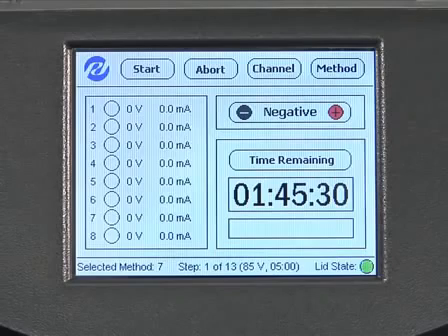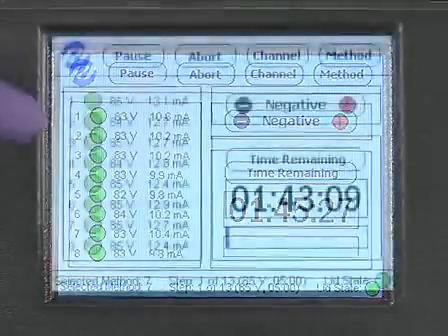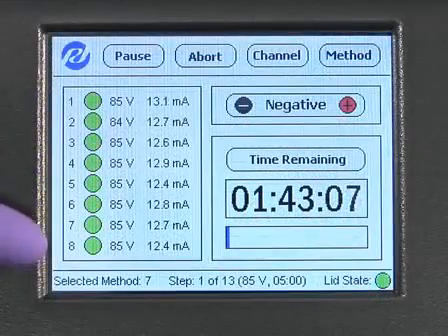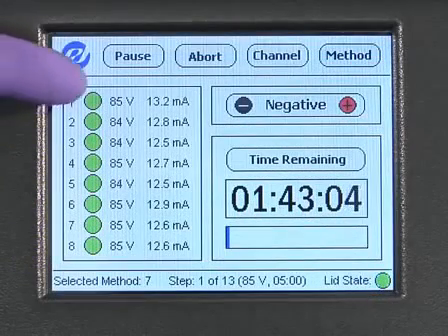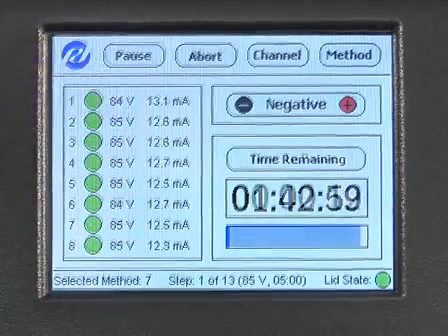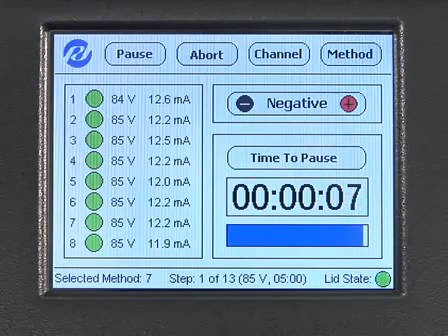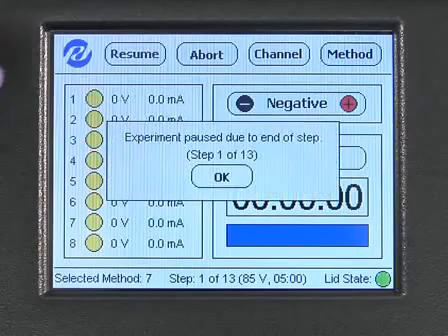Ensure that the safety lid is closed and that the indicator light is green at the bottom of the screen. Now press Start to begin the experiment. While the system is running, the circles shown in the box on the left side of the screen depict the status of each channel. A green circle indicates that the channel is active. The applied voltages and currents are displayed to the right of the channel status circles. The gel-free 8100 will automatically pause for fraction collection at the intervals specified in the method. When the instrument is paused to collect fractions, a text box will appear notifying you that a pause has occurred, and the status circles will turn yellow.